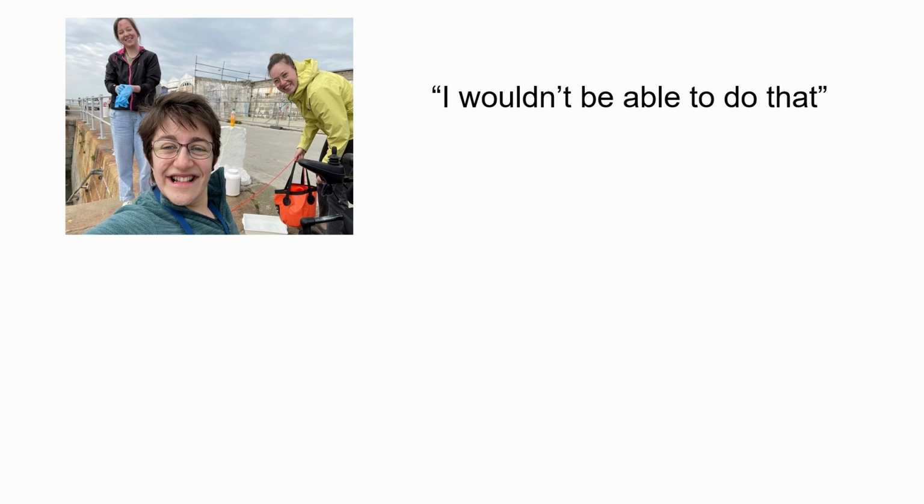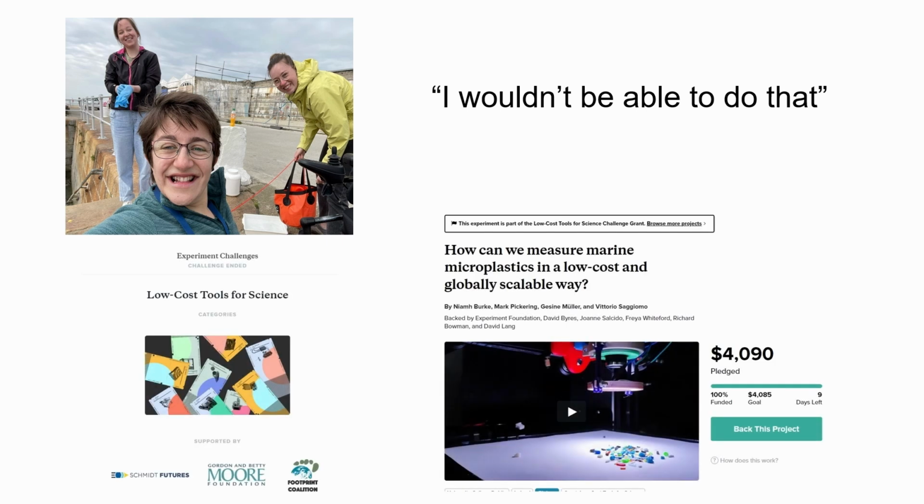So it goes to show you that you can put all this effort into making your tool low cost, open source, easy to build, but you can't actually make people build it. That is a confidence thing that needs to be fixed first. So this gave us the idea that we would apply for funding from University College Dublin and the Experiment Foundation to make 10 EnderScopes and give them to community groups.